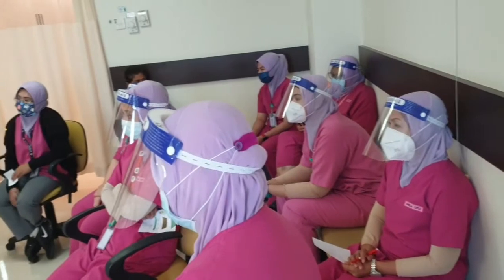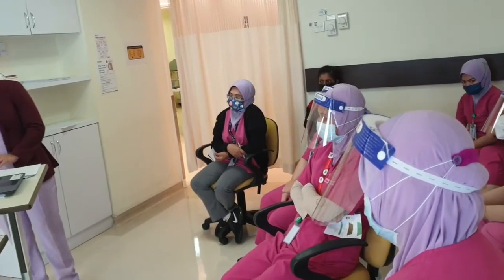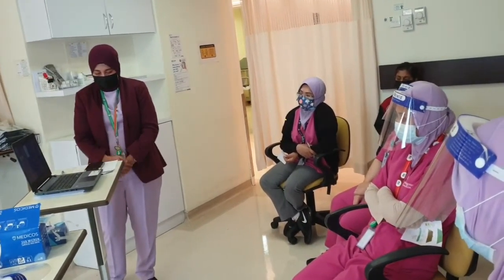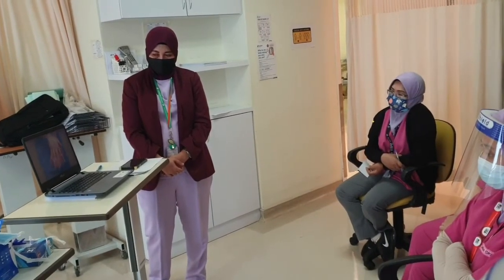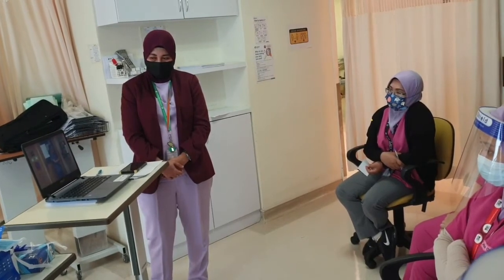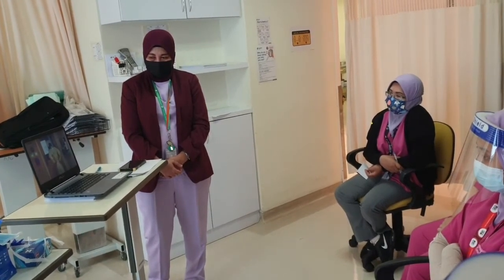To reduce risk of transmission, ensure hair is pulled back and jewelry is removed or minimized. For enhanced airborne, droplet, and contact precautions, start by performing hand hygiene for 15 to 20 seconds. Rub palms, wrists, in between fingers and thumbs, back of hands, and along the nail beds. Alcohol-based sanitizer is the preferred method, or use soap and water. Tie the gown at the waist, ensuring all clothing is covered.